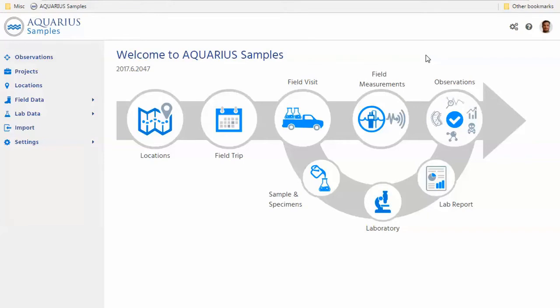So let's look at our example, maybe we did a study about contaminants in a watershed in the DC area, metals let's say, and I need to review that data. Max, you want to show us how that would work? Sure, let me show you how easy it is to bring up just that data within samples and to review it.